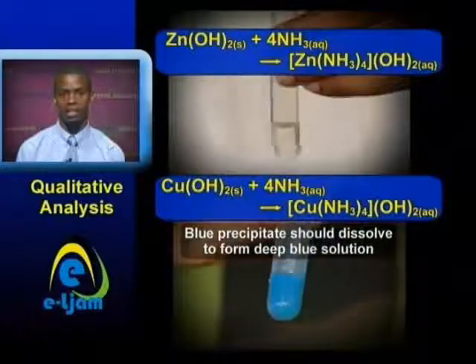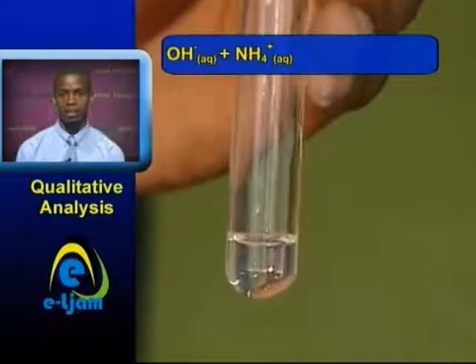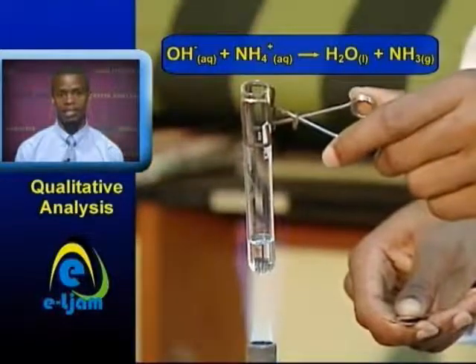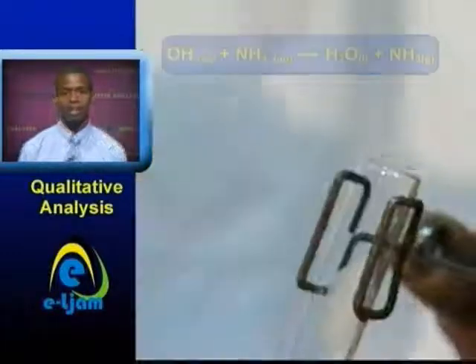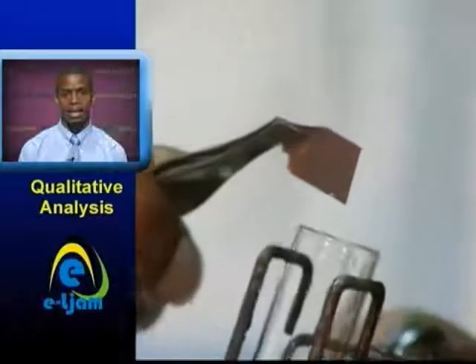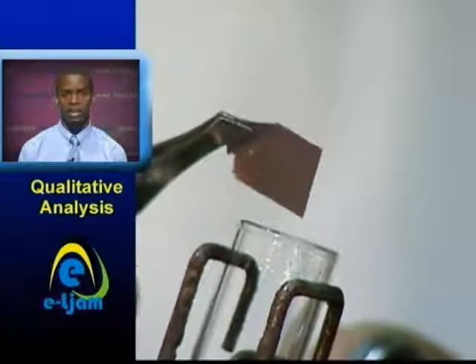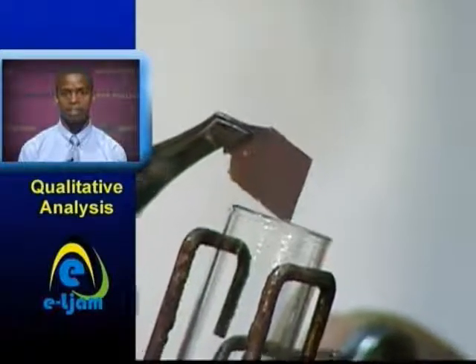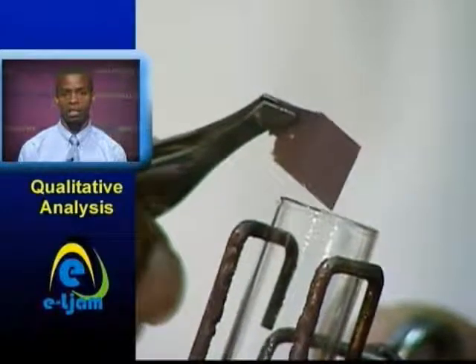Precipitates disappear. The ammonium cation does not form an insoluble hydroxide, but on heating reacts with the hydroxide ion, forming ammonia and water. Ammonia gas turns damp red litmus blue as it is alkaline in nature. It also has a pungent odor and forms dense white fumes with hydrogen chloride gas. The confirmation of the ammonia gas confirms the presence of the ammonium ion, NH4+.